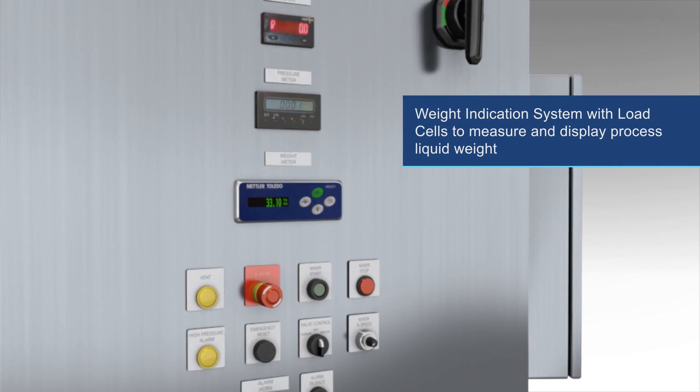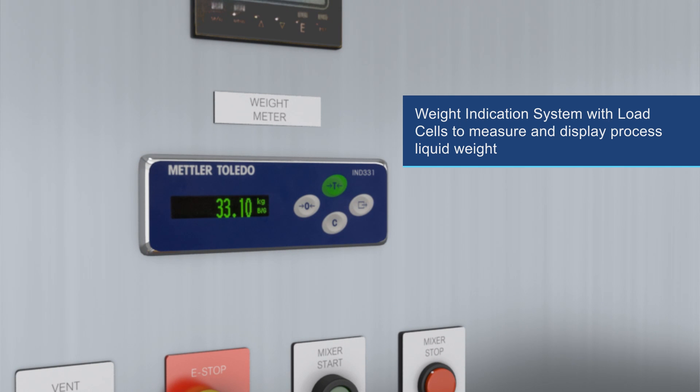A weight indication system with load cells to measure and display the weight of process fluid. Motor speed can also be controlled based on weight.